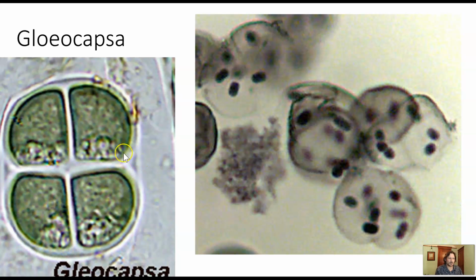And so here's an internet picture of Gleocapsa I got. You can see the outer covering of the original capsule here. We'll draw it in. So here's the original capsule. And then it's dividing here. We'll make another capsule to the inside. This is a slide where they actually used a very fine powder on it, kind of like ink. What it did is it stuck to the capsule. So this one has been stained in a very unusual way. So you can see that what would be dark here, those would be the actual individual green cells.